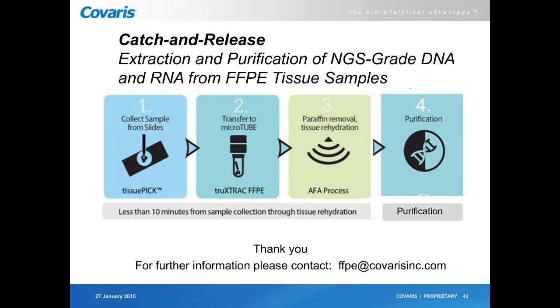Or is it stored at room temperature? Is it stored on slides? So many questions. If you have the choice, it's better to work with fresh blocks, especially blocks where you know all the workflow and the embedding workflow, but sometimes you don't have a choice. So you can work with a block as long as a few years if they've been properly stored and embedded. Okay. Is the tissuePICK affecting the sonication?